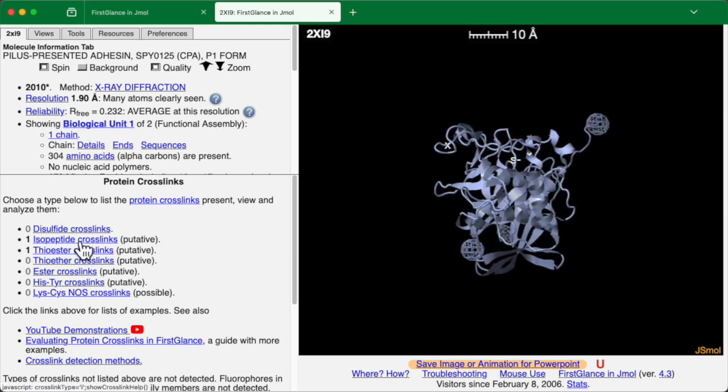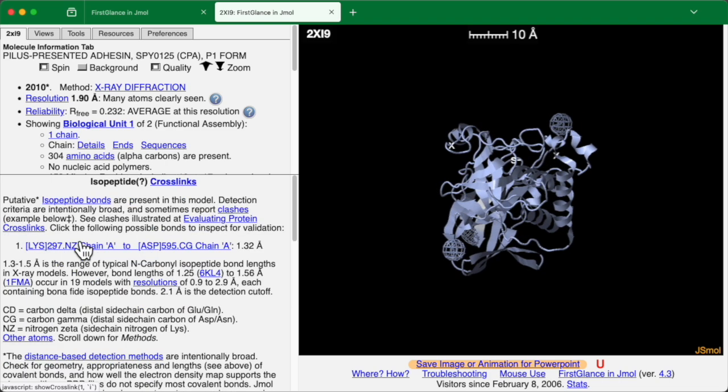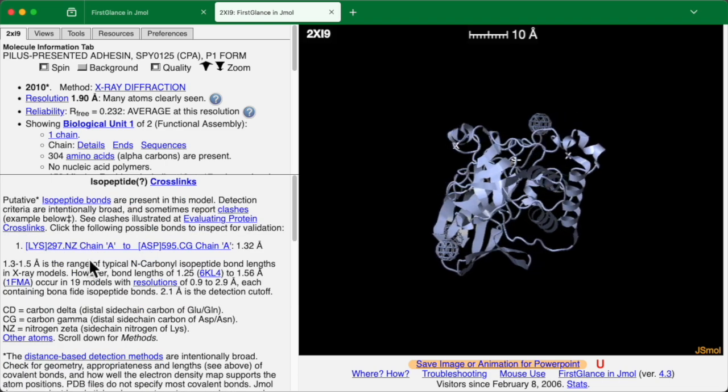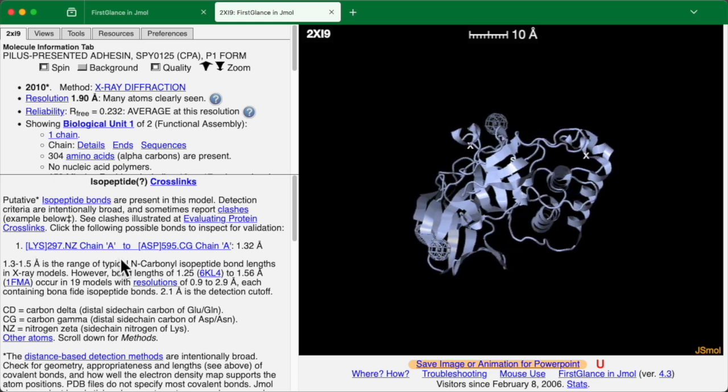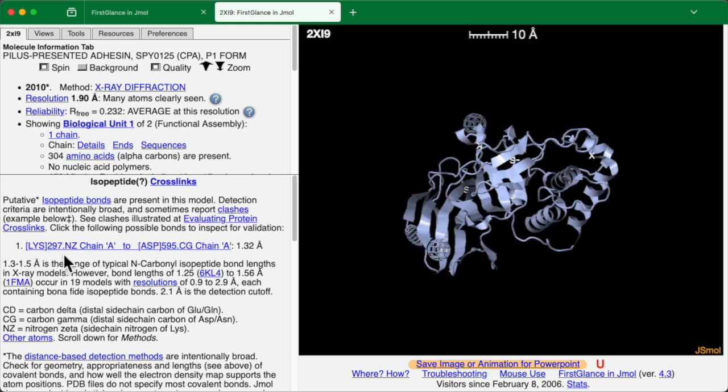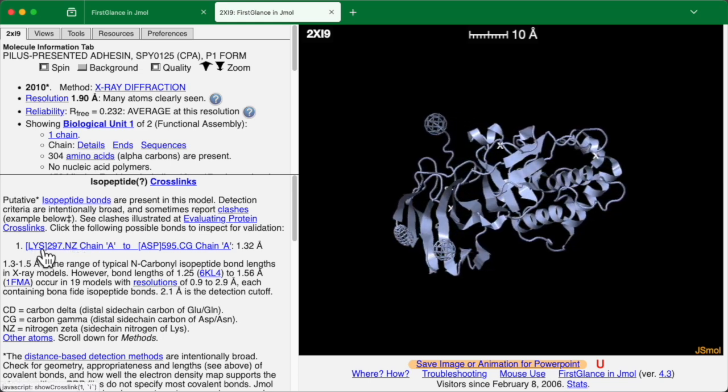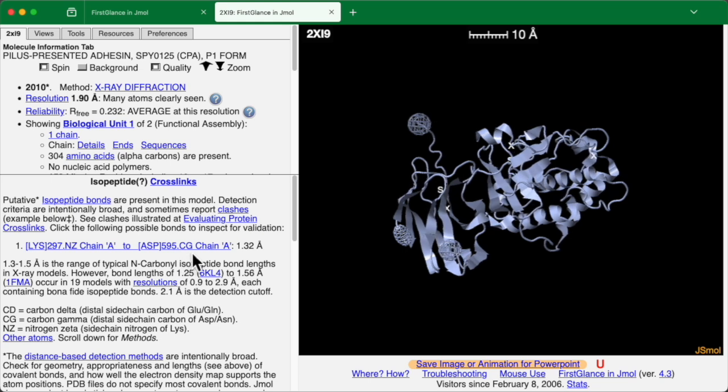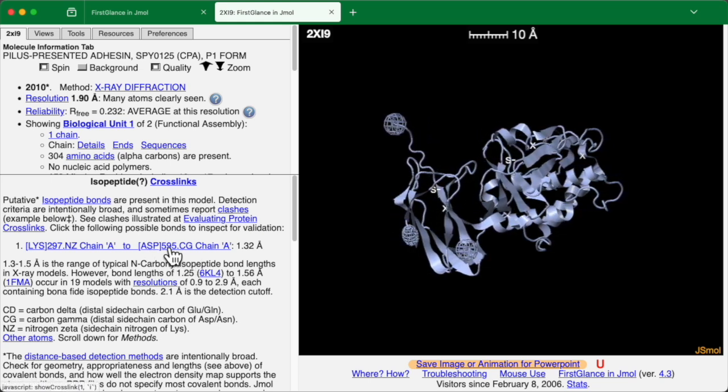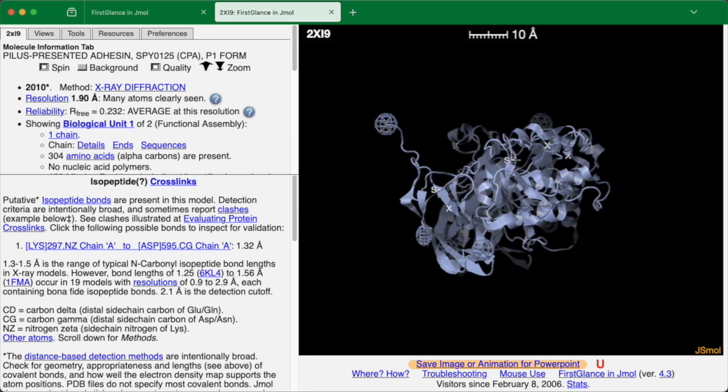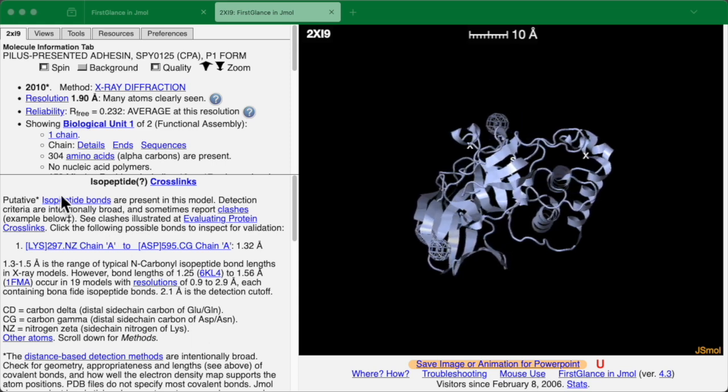Alright, so next we'll click on isopeptide crosslinks. And this tells us that there appears to be a bond between the zeta nitrogen of lysine 297 and the gamma carbon of aspartate 595.